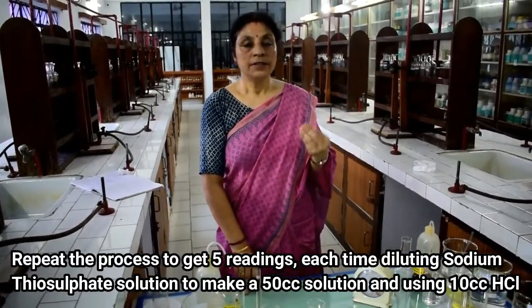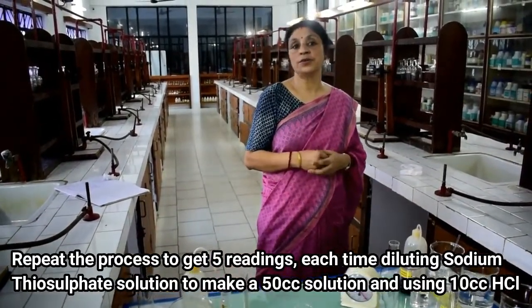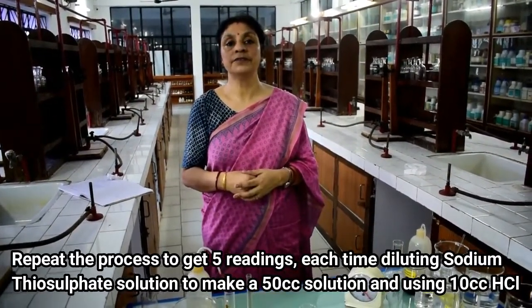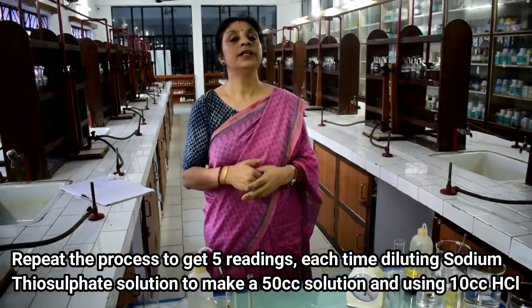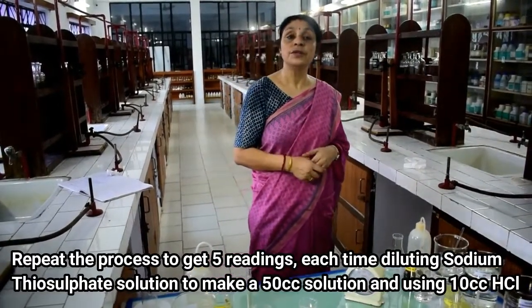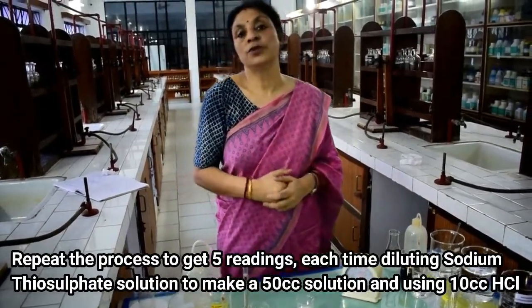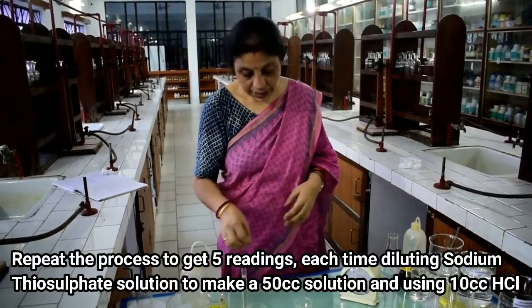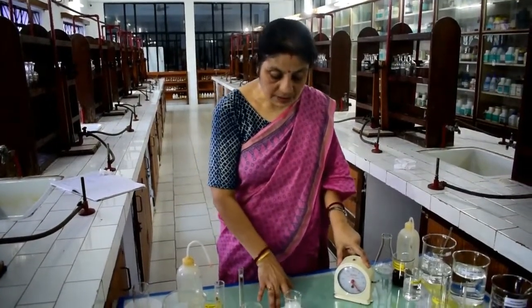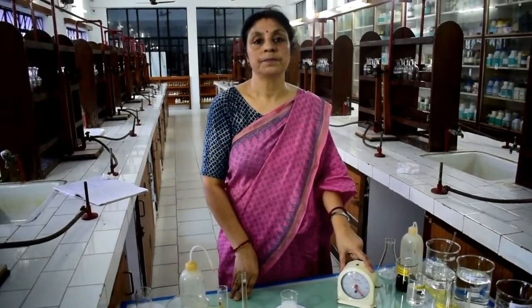This way, we will take the third experiment where we will take 30 cc of sodium thiosulfate and 20 cc of water. Again see the time for the formation of colloidal sulfur. Then in the fourth run we will take 20 cc of sodium thiosulfate and 30 cc of water, and finally 10 cc of sodium thiosulfate and 40 cc of water. Every time the volume of the sodium thiosulfate solution comes out to be 50 cc, and every time we are adding 10 cc of HCl, and we have to find out the time taken for the colloidal sulfur to be formed, or the time taken for the cross to be invisible.